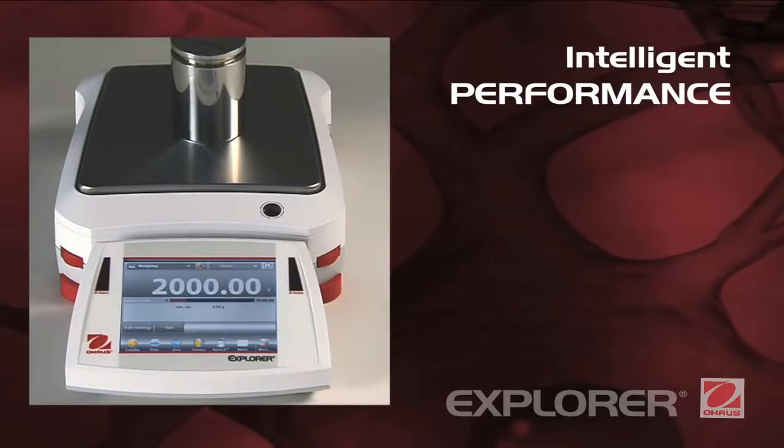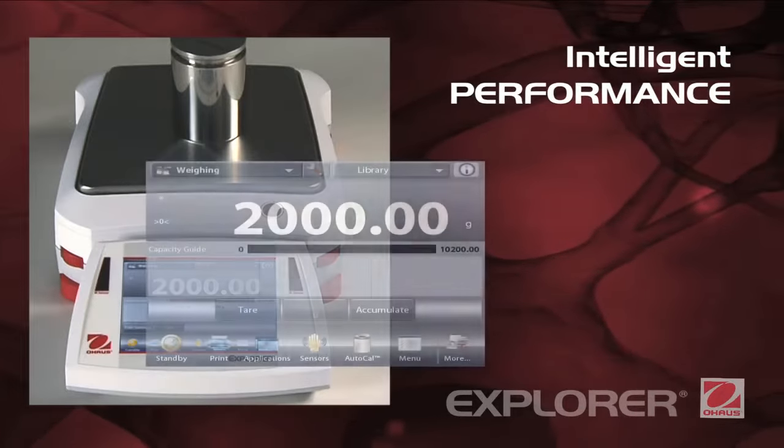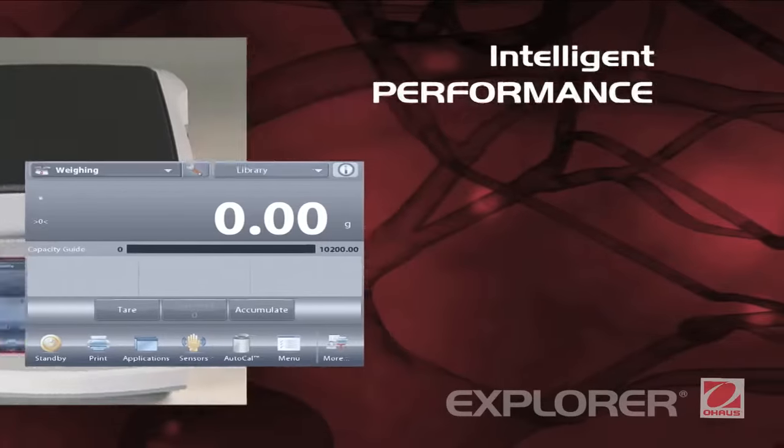Explorer delivers accurate results within seconds, improving operator efficiency, productivity, and throughput. Its superior linearity and repeatability specifications provide accurate, dependable results.